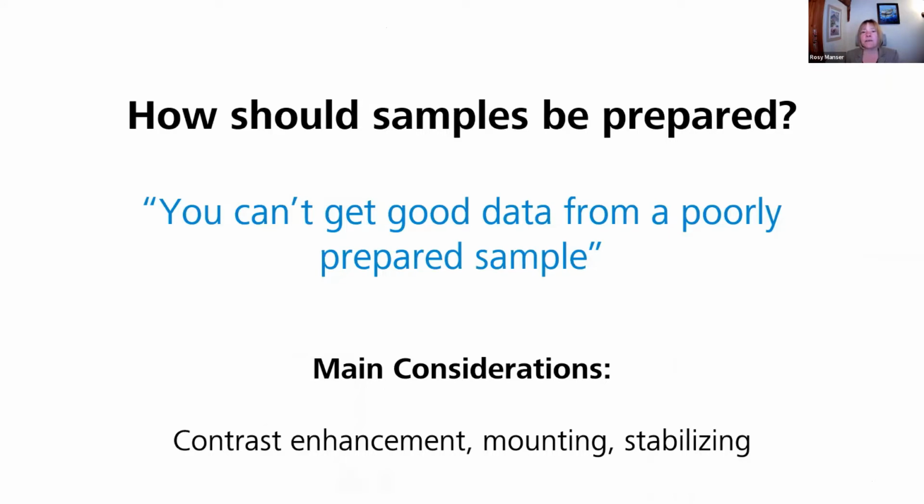So moving on a little bit to the sample preparation. I think anybody who's worked in microscopy knows this to be true, but particularly for X-ray imaging, you can't get good data from a poorly prepared sample. It really needs to be well prepared, well secured, and well mounted to be able to generate the best possible results. And for X-ray imaging, there are three main considerations that you need to take into account.